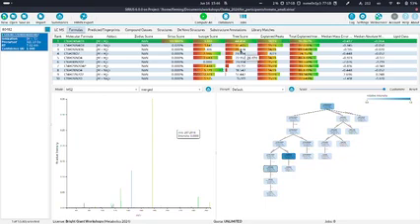So what we also have, besides the isotope and tree score, is the number of peaks which are explained by this particular molecular formula and its fragmentation tree, which is here in this explained peaks column. We have the total explained intensity. So this means, for example, that 96% of the total intensity can be explained by this molecular formula. We also have some errors, which I'm not going to go into detail here. And this last column is part of the lipid class detection.